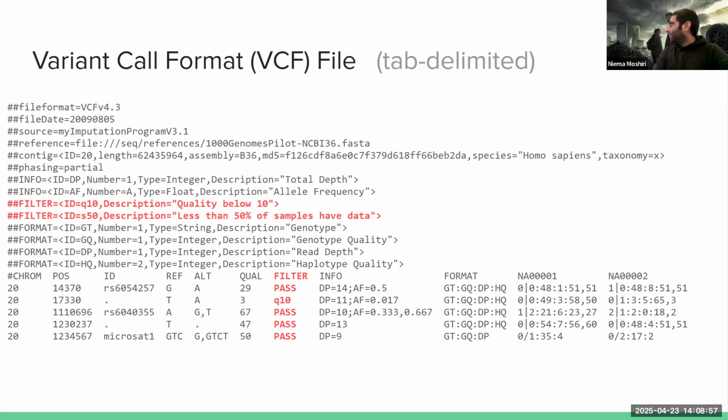Good question. Yes, the question was, can you code for these filters or would you be able to use something from a library? So there's a toolkit called VCF tools that I didn't include in your lab, but I think if I teach this class in the future, I'm going to add it to the lab because I think lab 4 is a little bit short. VCF tools, and there's another tool, BCF tools. They're two tool suites that you could do all sorts of manipulations on VCF files. So you could take an input VCF file that's spit out by a variant caller, like I think in the lab you use lowfreq and freebayes. You can take one of those VCF files and then run VCF tools and specify all these different filters you want, and then it'll output a filtered VCF file that has all the same information, but then includes these filters.